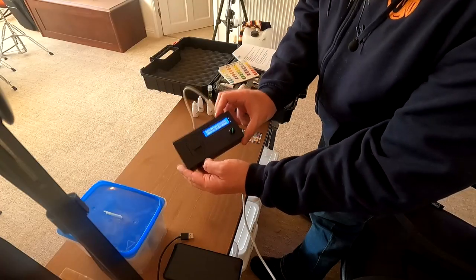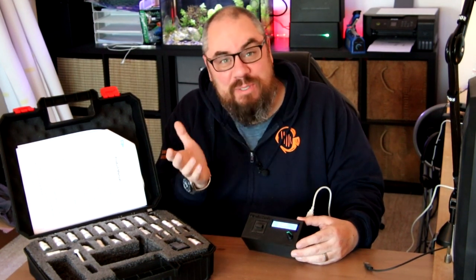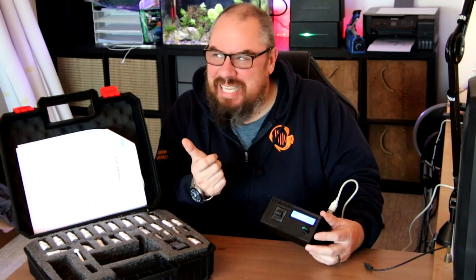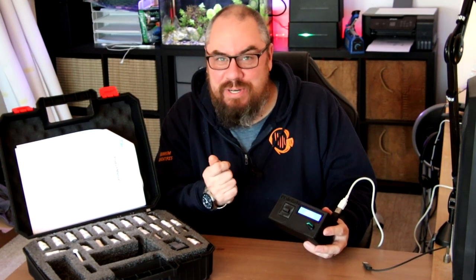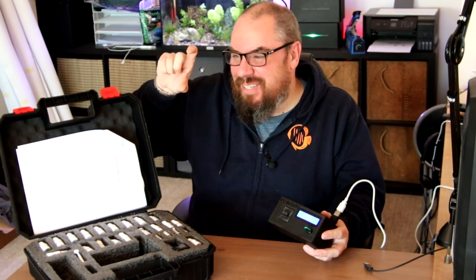We're into what I think is the final minute of the Diode Probe test. The ammonia test has passed its five minutes on the API kit, and I read that as 0.25 parts per million. It might have got a touch darker since it's been sitting an extra few minutes, but that's what I read it as. Which is not brilliant — you don't want anything in there — but we can deal with these things. Let's see what the Diode Probe says. And there we are — the result: 0.66 parts per million.